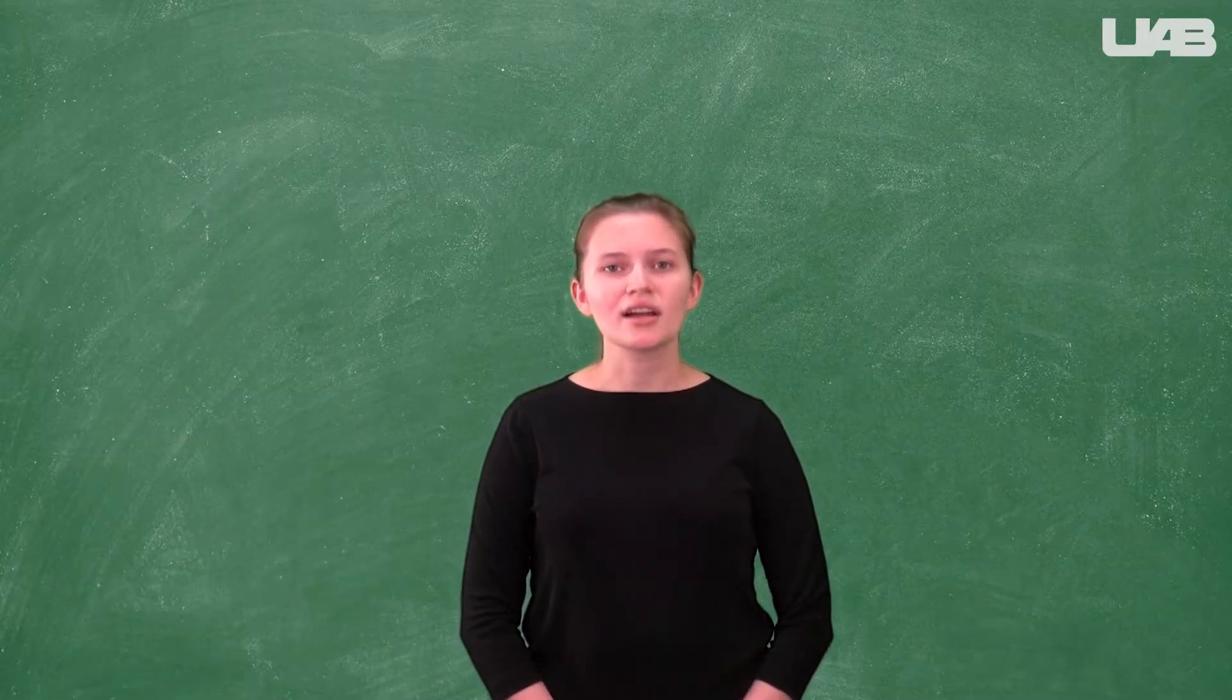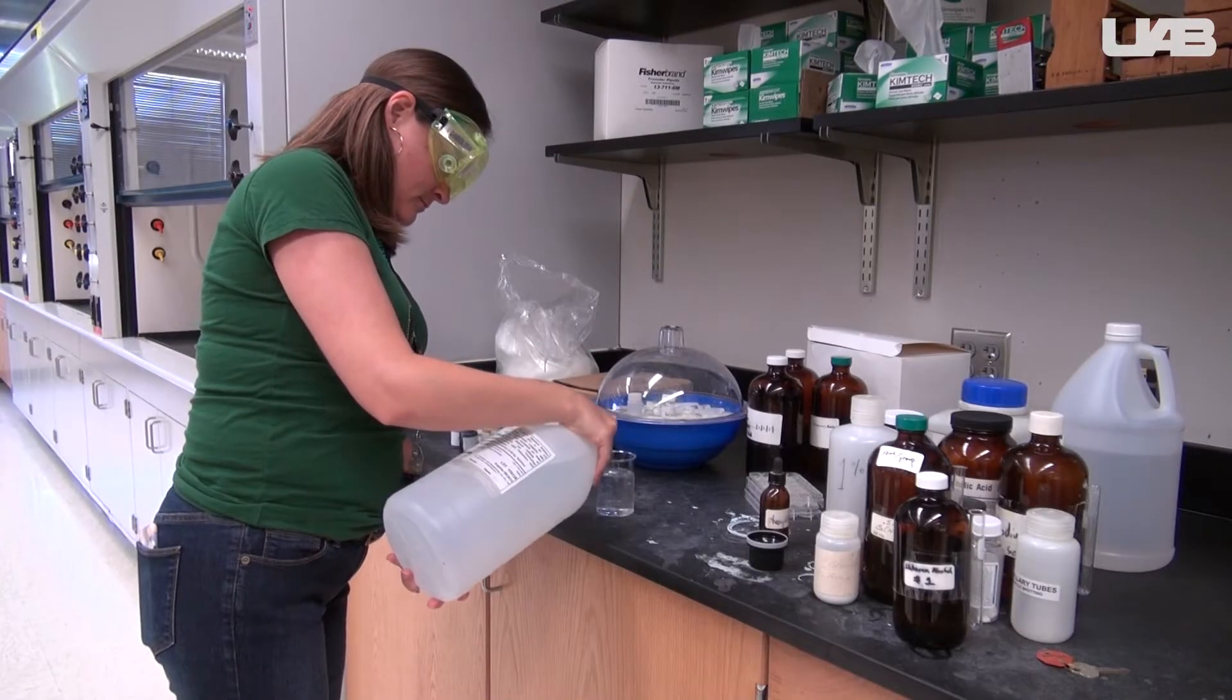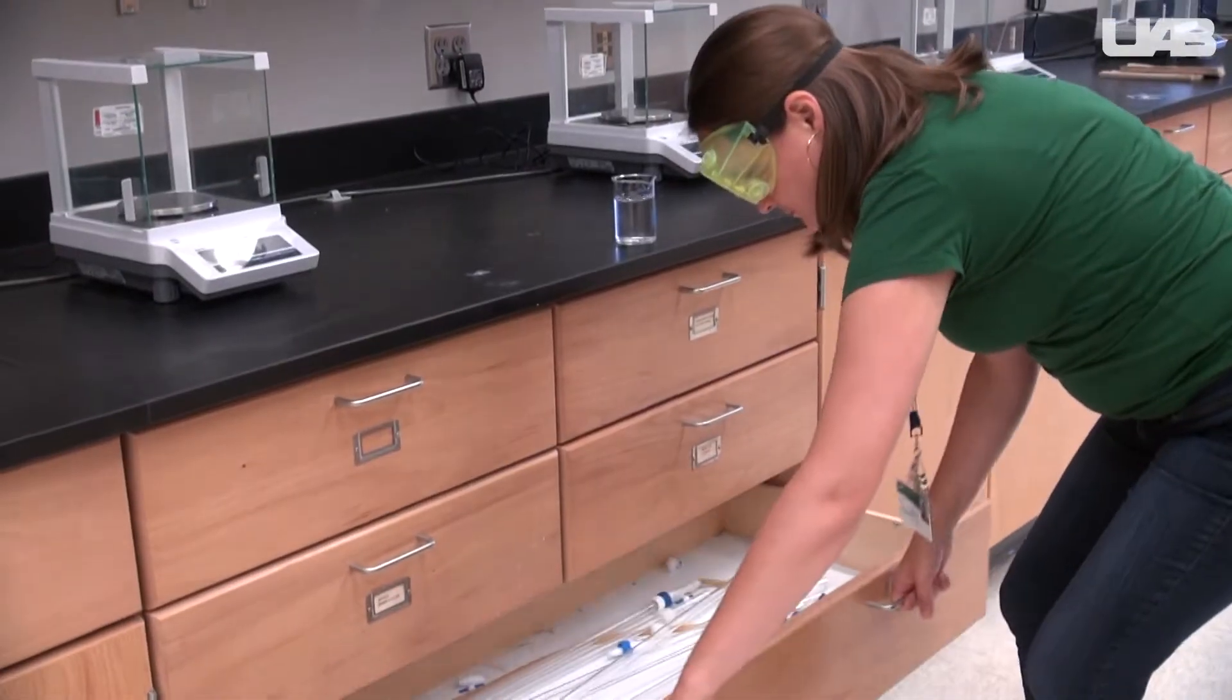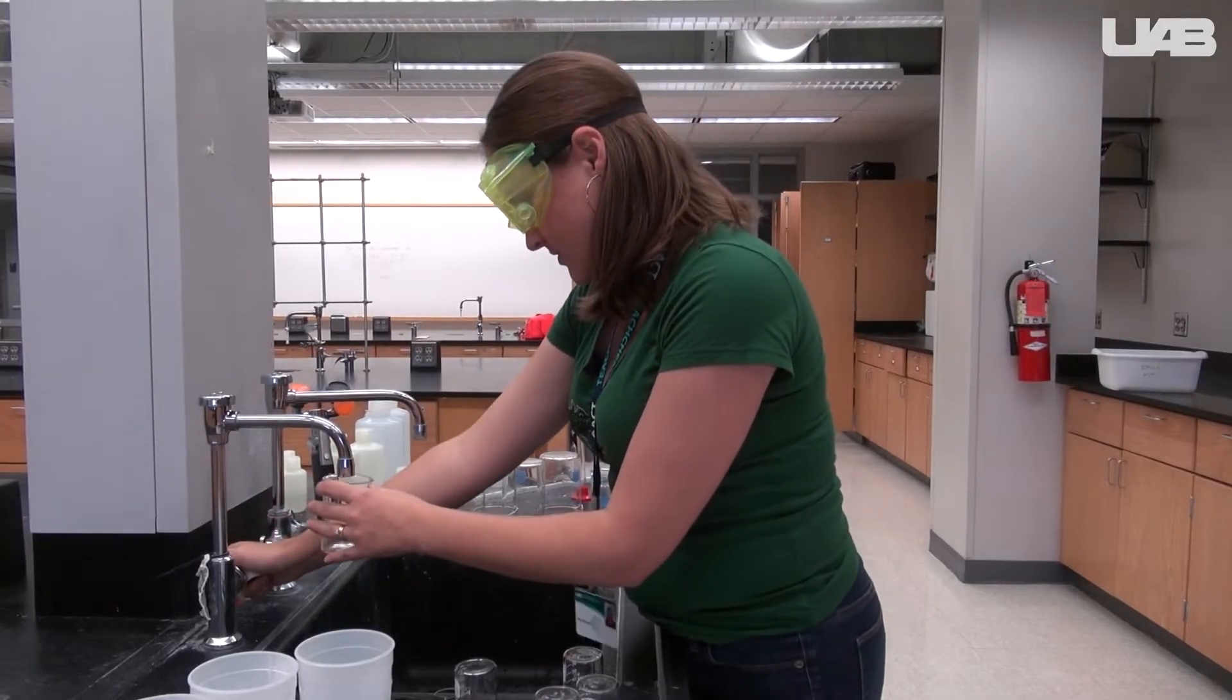Since the sodium hydroxide solution will be in the burette for all of our trials, we need to prime the burette before using it. First, get a beaker of the sodium hydroxide solution. Select a burette from the drawer, then go to the sink. Fill a second beaker with distilled water.